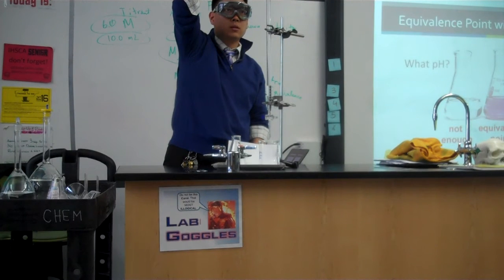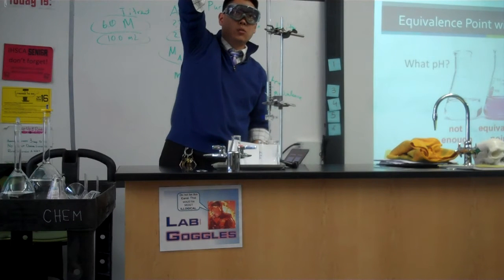Do you have to fill it up or just put it in a roll? Wait, we clean it before? Yeah, we clean it before with water. Oh, this is pure water, distilled water.